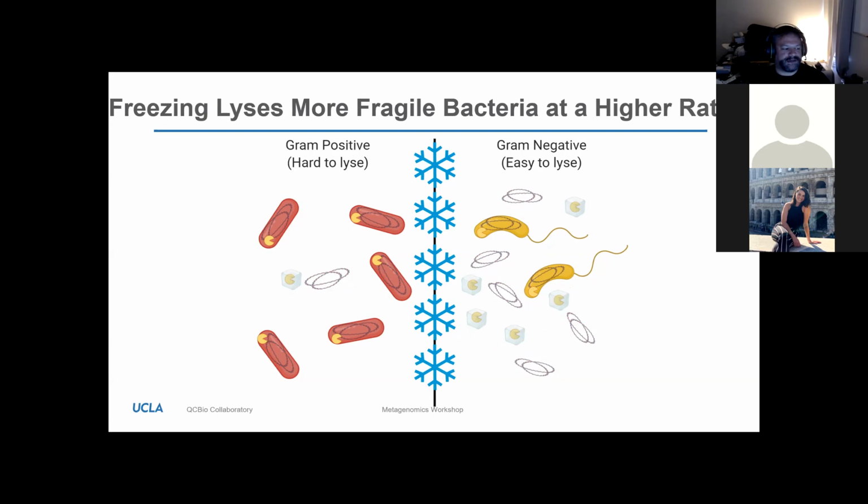And these bacteria contain a couple things that we really care about right now. We really care about the bacterial genome, because that's obviously what we're monitoring and what we're testing for. That's our primary analyte. They also, however, contain DNA degradative enzymes, so endo and exonucleases that basically just want to chew up this DNA. Now, the good thing is no bacterial species is going to contain a nuclease that is going to chew up its own genome, because that's pretty much an evolutionary dead end. If you chew up your own genome, you die.